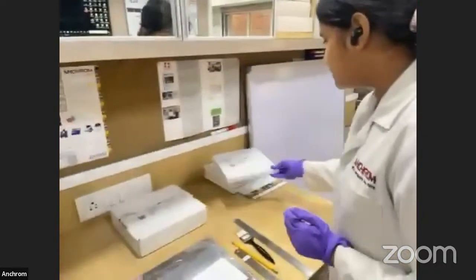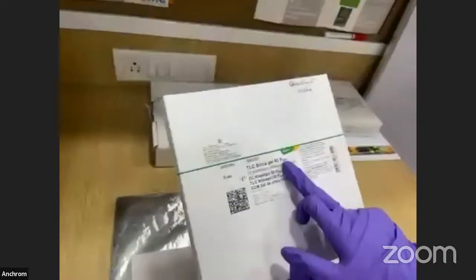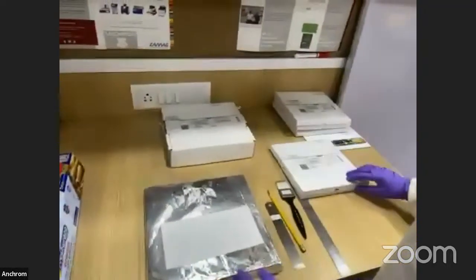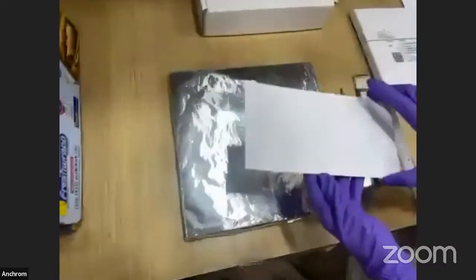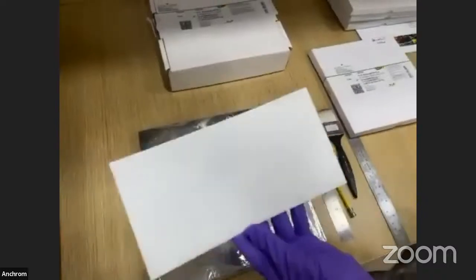Okay, so now we'll see the live demonstration for performing the DPPH assay. You must have seen in the presentation, our samples have already been kept ready. The first step is the selection of the stationary phase. This is the TLC silica gel 60 F254 stationary phase. For today's analysis, we will be requiring 20 by 10 centimeter.